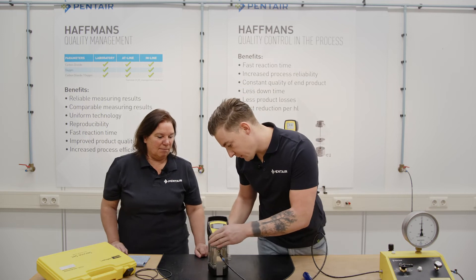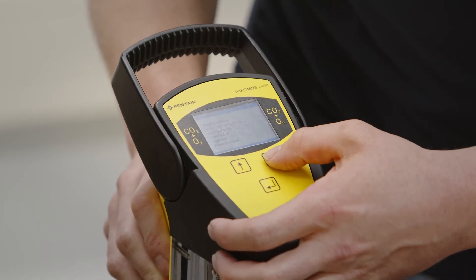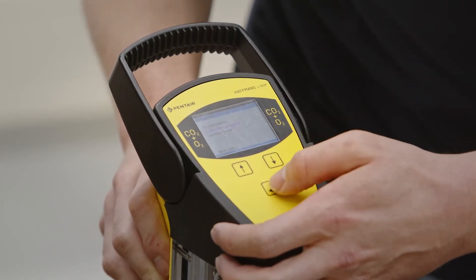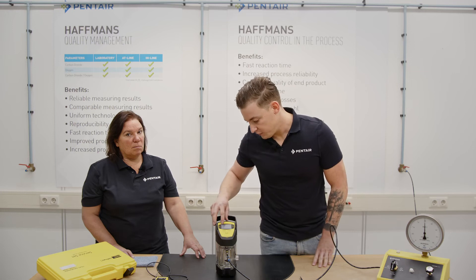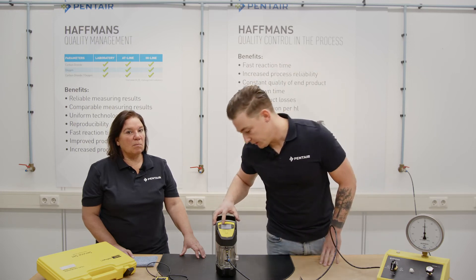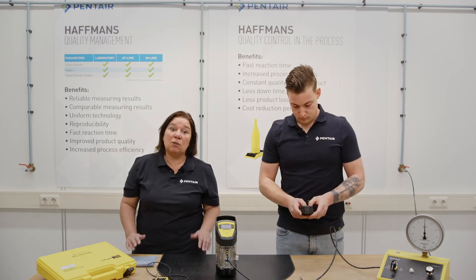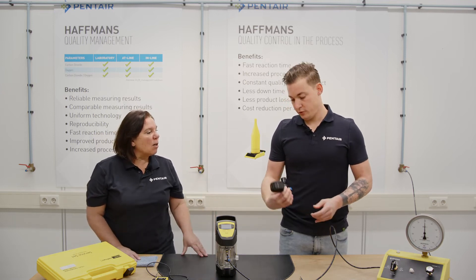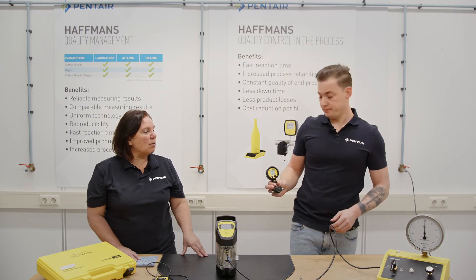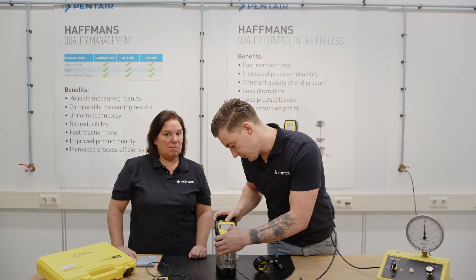We go back in the service menu and navigate to calibration pressure. Start the calibration by adjusting today's atmospheric pressure in the calibration menu. If you don't have a barometer present, you can also find today's pressure online. We can read it on our own small precision gauge — it reads 1022, so we put in 1022 and press enter.